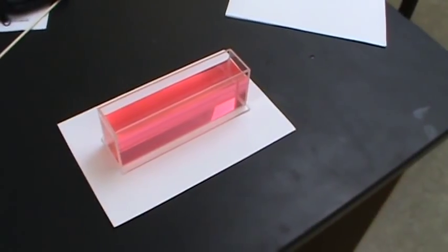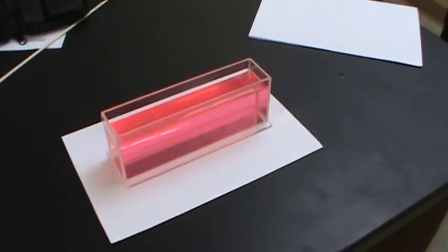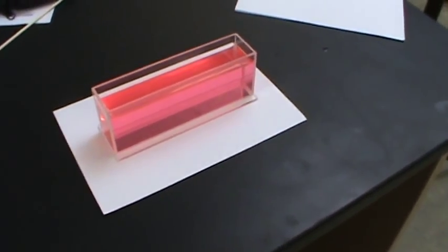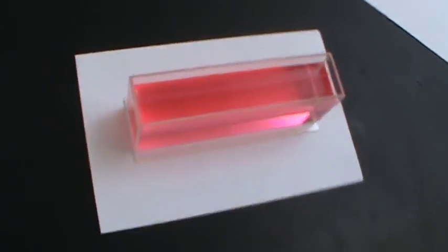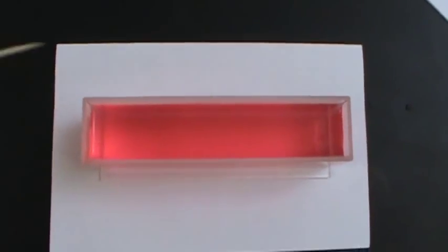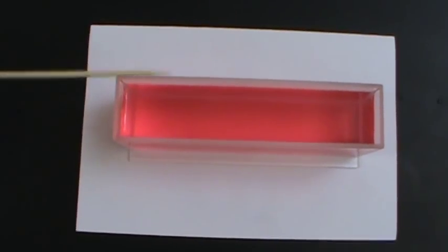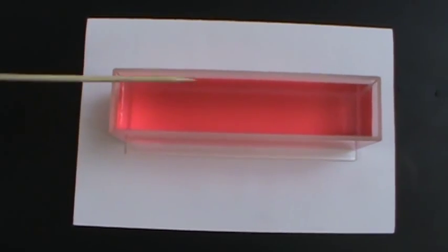To get a better idea of path length, let's take a look at a little bit larger scale system so we can really get a feel for that. Here's a cell that we can use to take a look at path length. You can see I've got red in there. Again, that's just red food coloring in water. And if we look at the geometry of this cell, it's 15 centimeters long and 3 centimeters wide.